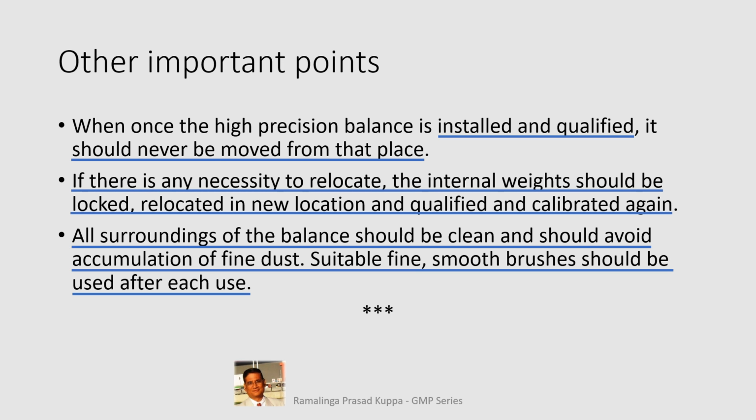I hope that the information on operation and care of the balances is understood well. Check that your current SOP on operation of balances has all these salient features, including a provision to weigh different types of materials with different characteristics.